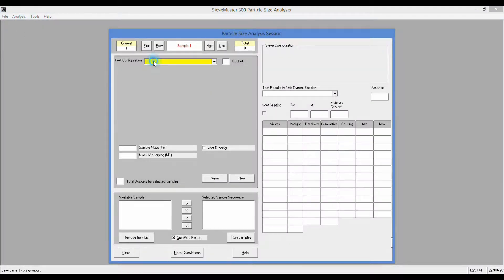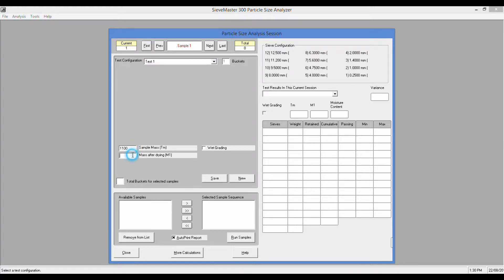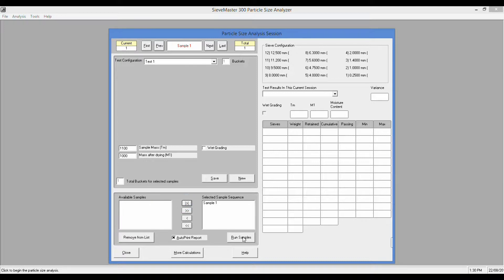It substantially reduces the resources required for manual particle grading, minimizes the risk of operator error, and frees up valuable time that the operator can use to perform other tasks.